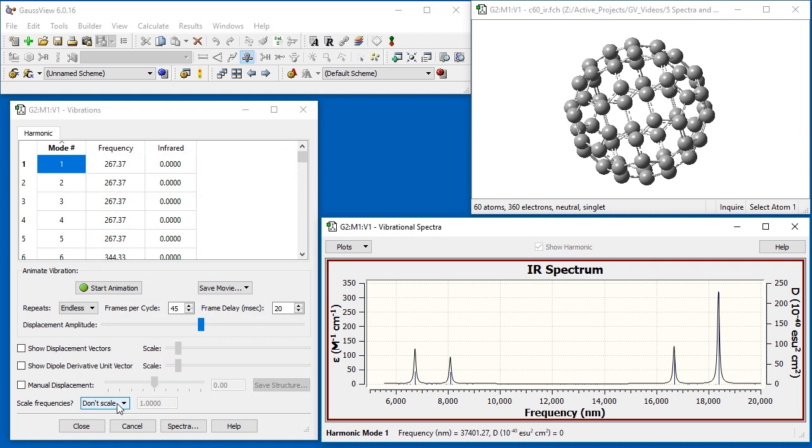GaussView can also scale the frequencies within the spectrum display using the field at the very bottom of the dialog.